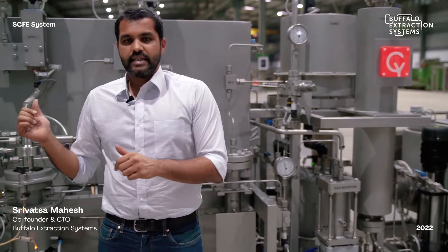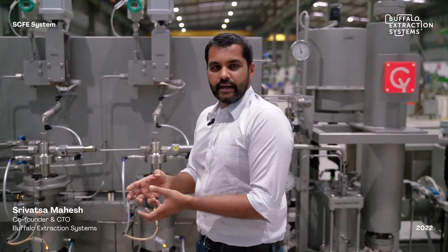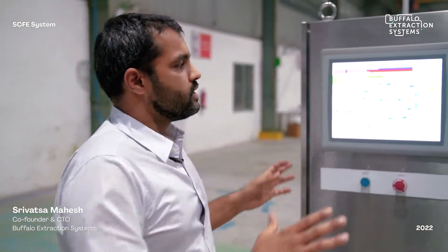Let's go to the back of the system, which is the technical area. Everything on the front side is where the biomass and oils are handled, so there is no technical equipment like pumps or motors that could cause any contamination in your product on the front side.